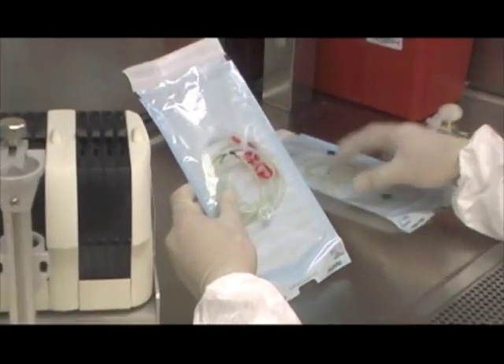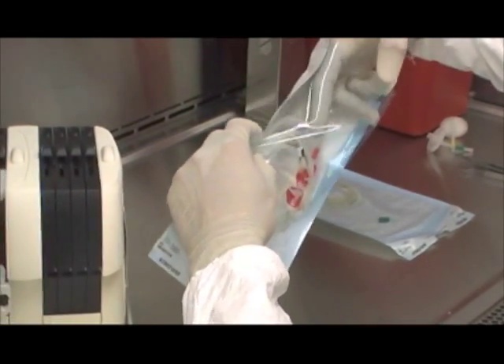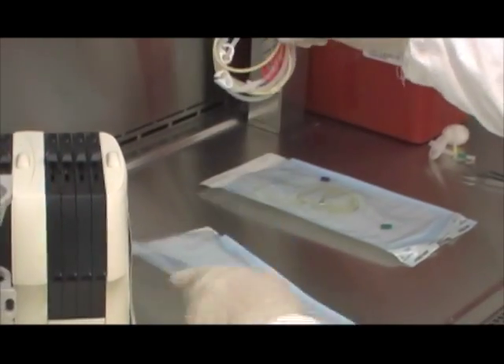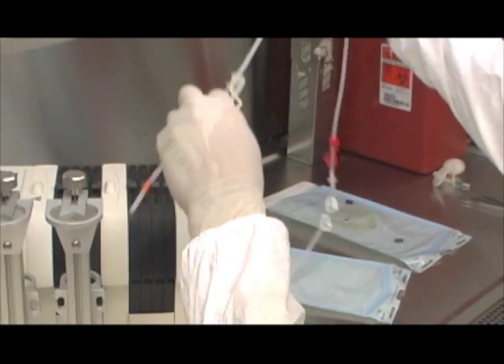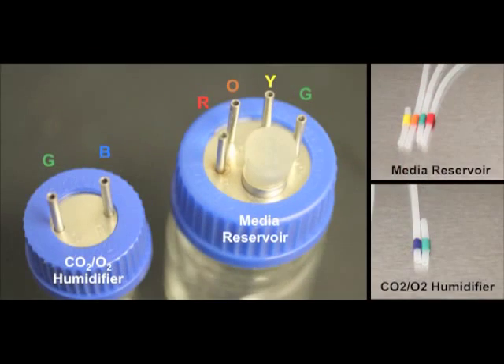Take the medical-grade silicon tubing out of the autoclaving bags and prepare for assembly of media and CO2 transport tubing. Each media and gas perfusion tubing is matched to each bottle set. Within each bottle set, media and gas perfusion tubing has been color-coded to match a pressure-stamped letter on top of the bottle's metal cap — for example, R for red and B for blue. The color scheme reduces tubing assembly time and prevents tubing mismatch.